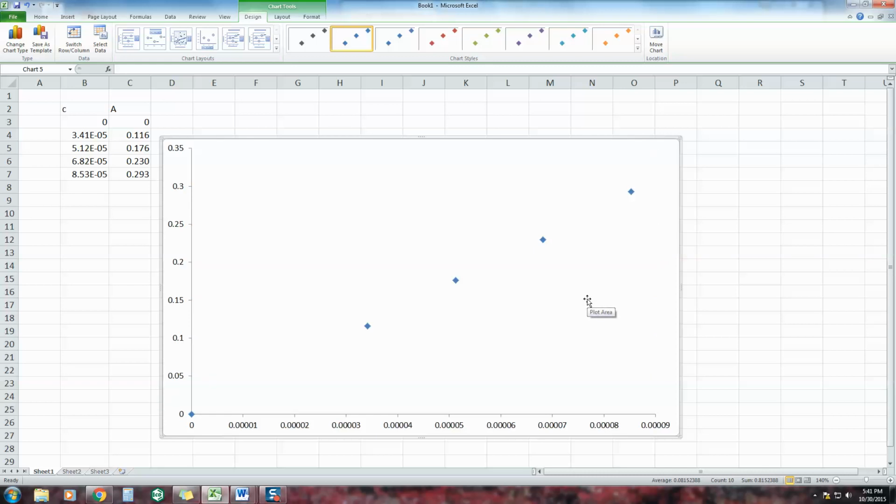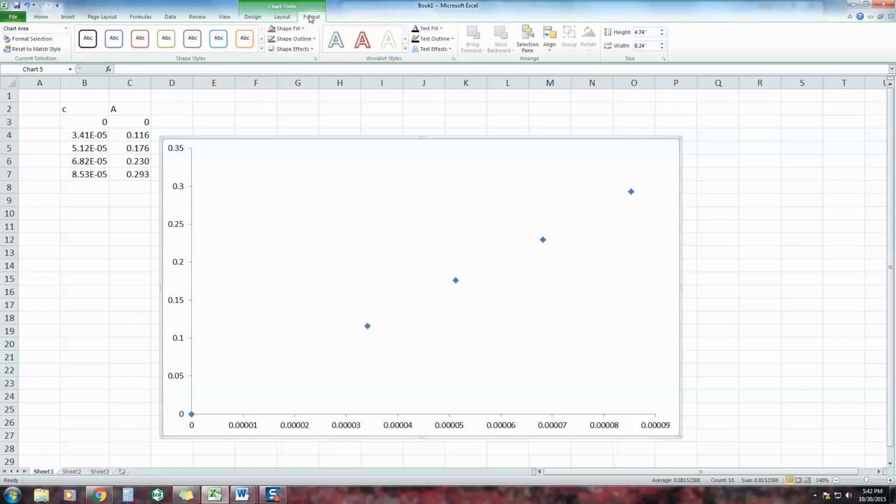So we've really cleaned up and neatened up our graph quite a bit here. But unfortunately our graph's missing some important stuff. And so important stuff that's missing is going to be titles and labels for the axes. So if we go up top here, now that we have the chart here, we have chart tools, we have design, layout, format, things like that. We don't need to get too fancy here.